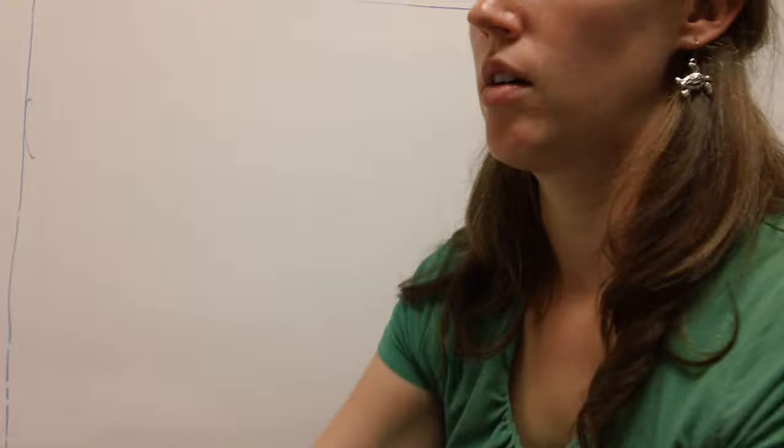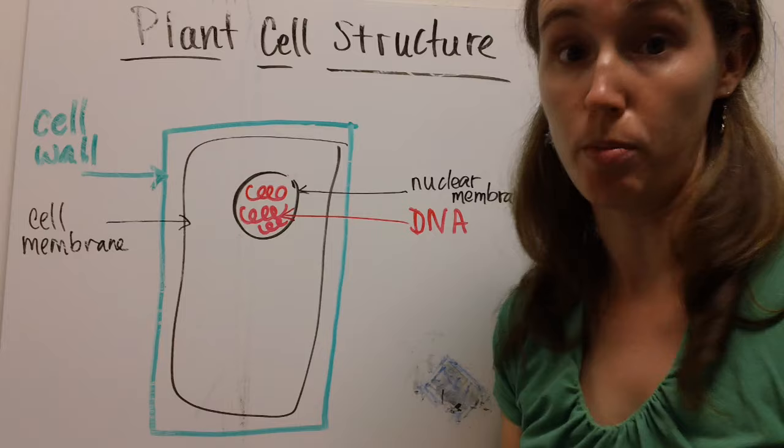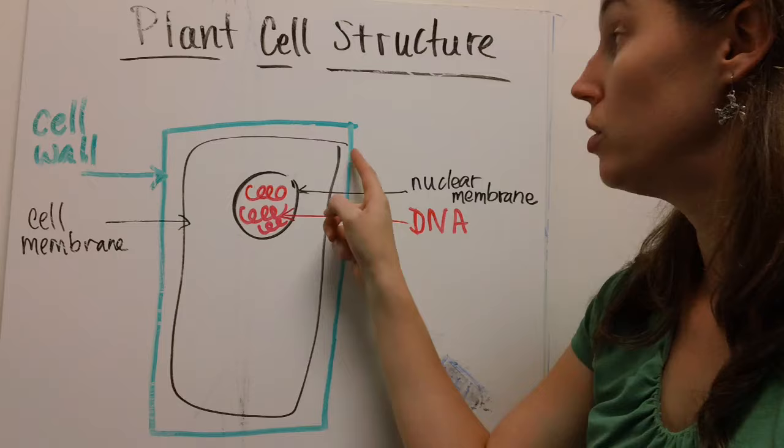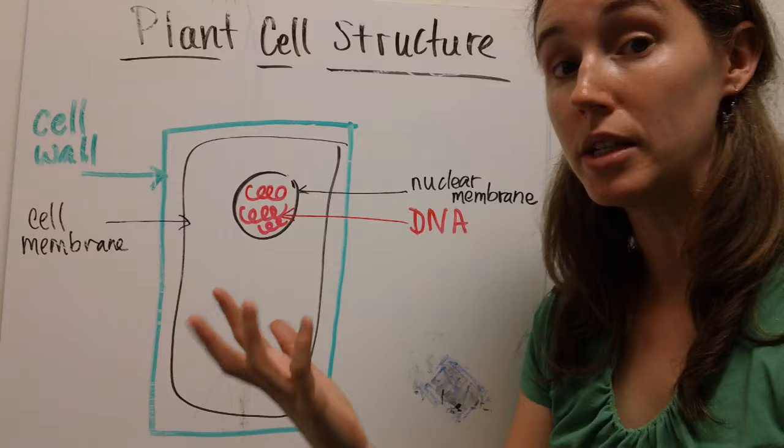Before we can get to the DNA in strawberries, we have to break down some barriers. If you remember your basic plant cell structure, we're going to have to break through the cell wall made of cellulose. Then we're going to have to break through both the cell membrane and the nuclear membrane that are both made of lipids in order to get to the DNA inside. Now, how are we going to do that? You did it in your experiment, but we're going to look at the exact reasons for each step.